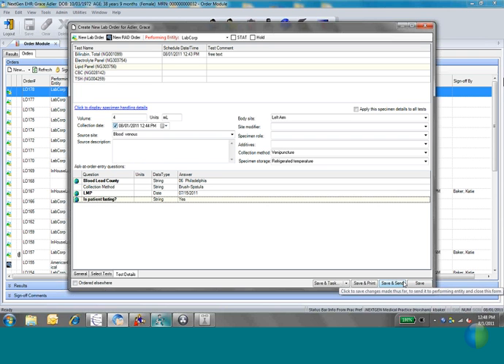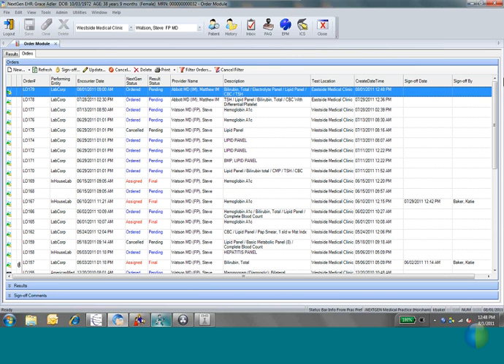If you have to send it to the vendor and print a requisition at the same time, I recommend doing Save and Send first, and then coming out here where your order has now been saved. It's the top one in the list, and click the print button right up above it. Here, I'll do this one so you can see the requisition. So if you save and send, it goes to the vendor, and now you can just print a requisition. That's the part I was saying is kind of difficult. It doesn't really work because the buttons are separated to either print or send to the vendor. It didn't have one for both.